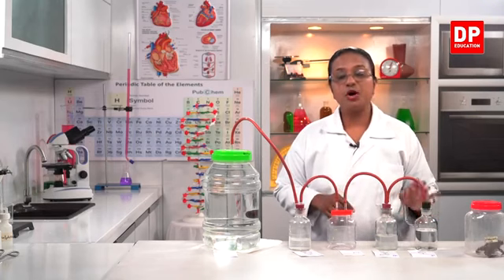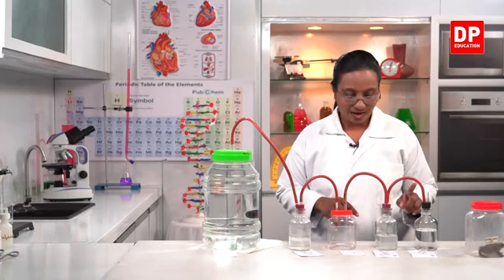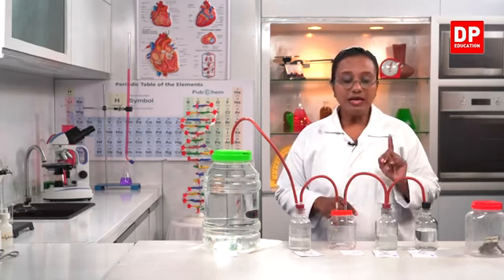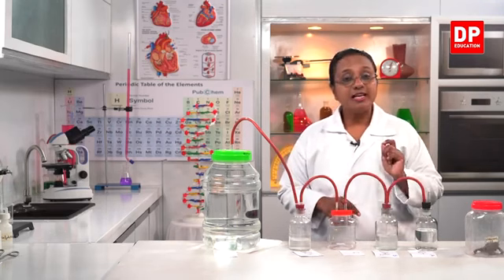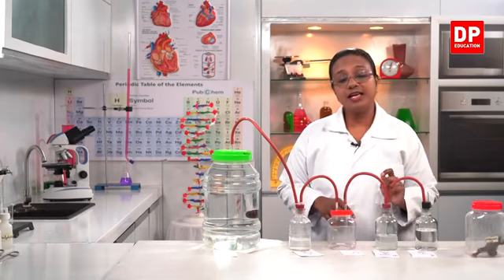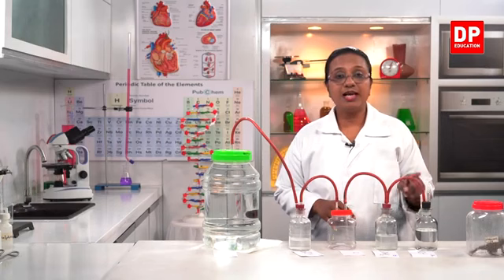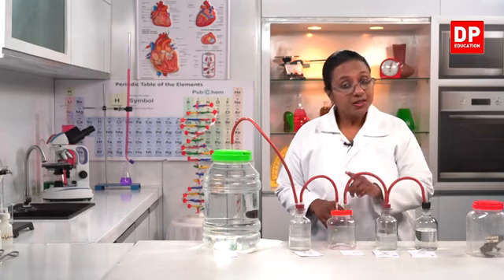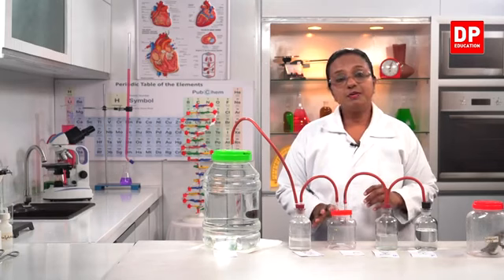It is to absorb carbon dioxide that is present in atmospheric air. Then the second bottle B contains lime water, that is calcium hydroxide, that is to test whether there is any carbon dioxide in air that enters from bottle A into bottle B. Then we have bottle C, where we put or keep the frog.